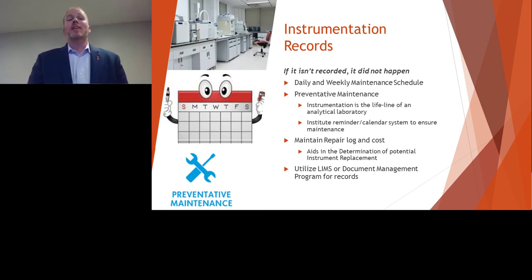And it should be the same way for you as a laboratory director or laboratory manager. If you can't look in a notebook or within the LIMS system that does any type of recording for your instrumentation, if it's not there, it didn't happen.